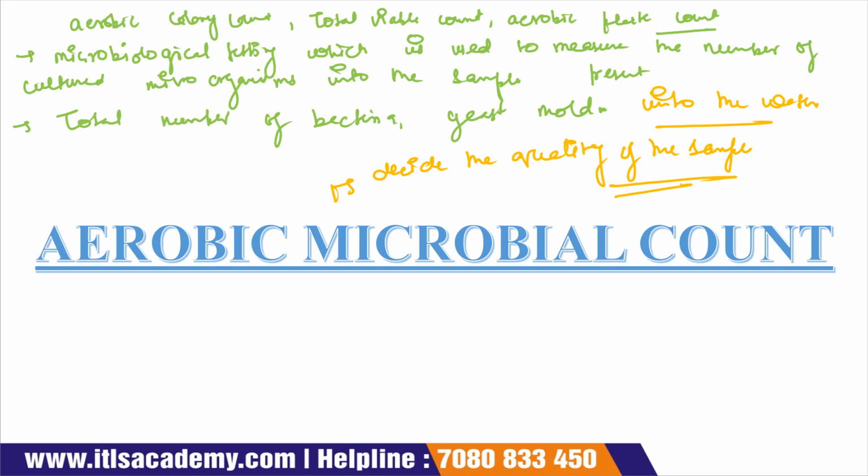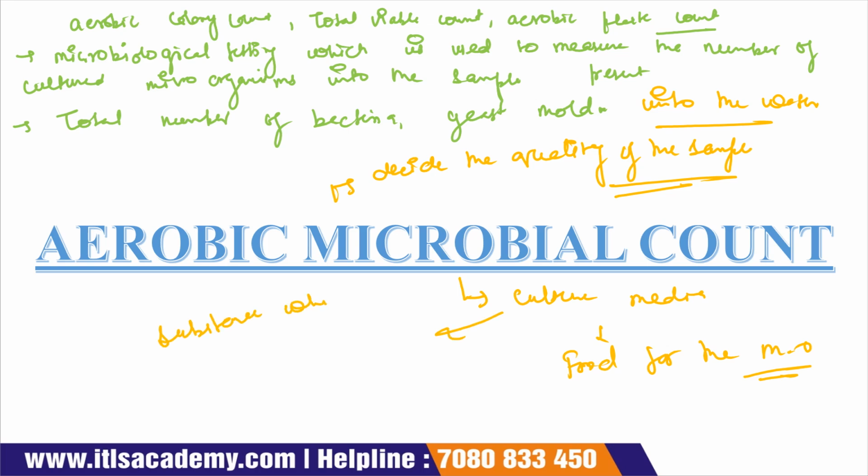And this aerobic microbial count is detected using culture media. What is culture media? It is the food for the microorganism, or you can say the substance which is used for the growth of the microorganism.